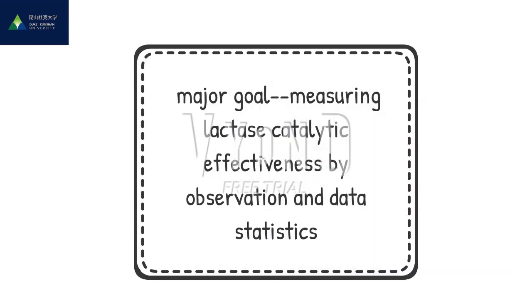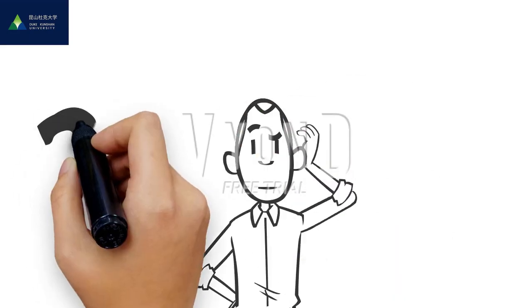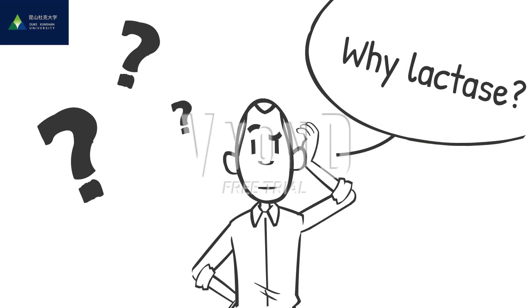In this experiment, we have a major goal, measuring lactase catalytic effectiveness by observation and data statistics. First question, why do we choose lactase as our subject? Noting that the catalytic efficiency varies between different enzymes, we should only focus on one kind of enzyme when measuring.